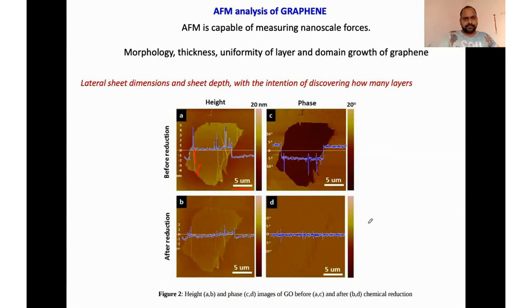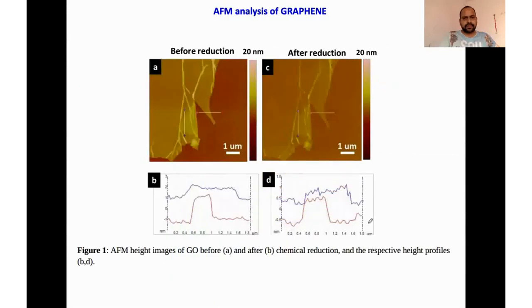We can get the hexagonal structure very easily. We also get information about electronic structure, mapping of the local density of states as a function of energy, and the number of graphene layers. Graphitic carbon with a large number of layers can be distinguished.